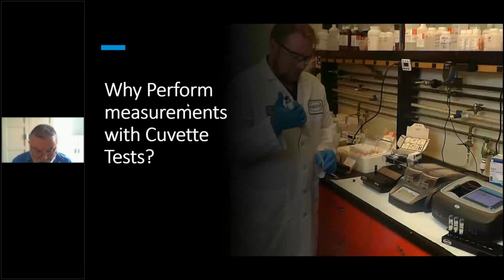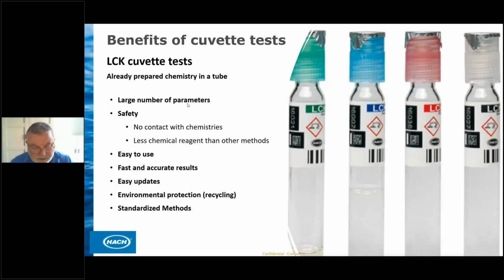Now let's talk about a different chemistry, cuvette tests, and the benefits it brings over traditional chemistry. In cuvette tests, depending on the parameters, all or most of the chemistry is already present in the tube where the measurement will be made.